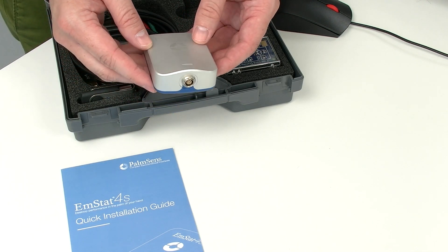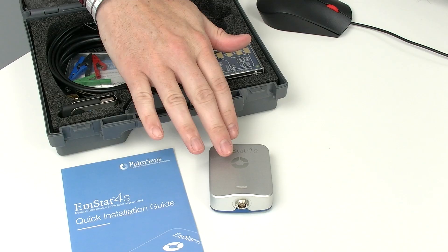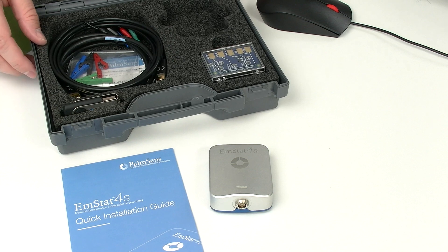This one has a blue bottom — maybe you have a different one with a black bottom. The black bottom indicates that this is the high range version, while the blue bottom, which is what we have in this case, indicates that this is the low range version, more suitable for measuring lower or smaller currents.